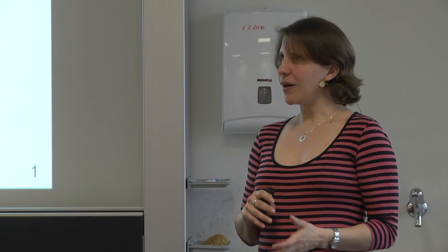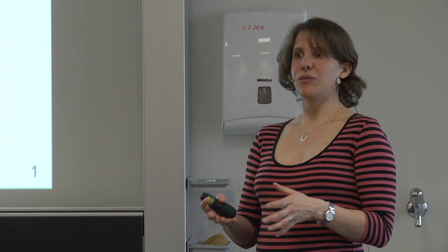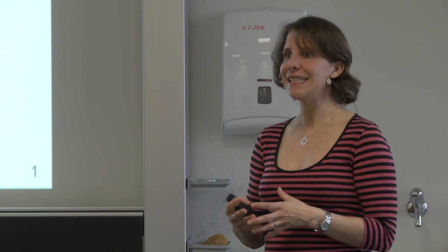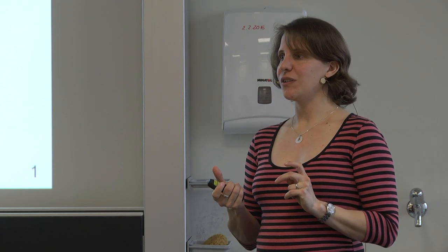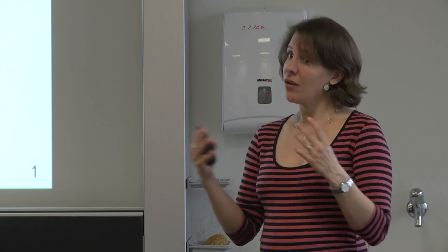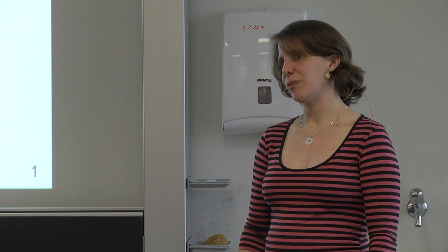I would say the standard way is just to take the average of all peptide ratios that you have measured. That's what people often do, especially in the world of SRM. However, people have also worked a lot on smarter ways, again putting weight on different peptides in a different way, depending on how good their quality is. And I'm happy I can refer here also to Olga Witek's talk. Olga Witek will do the statistics part tomorrow and the day after, and there this topic will come back. One easy way to do it in Excel is just to average all peptide ratios that you obtained to derive a final protein ratio.